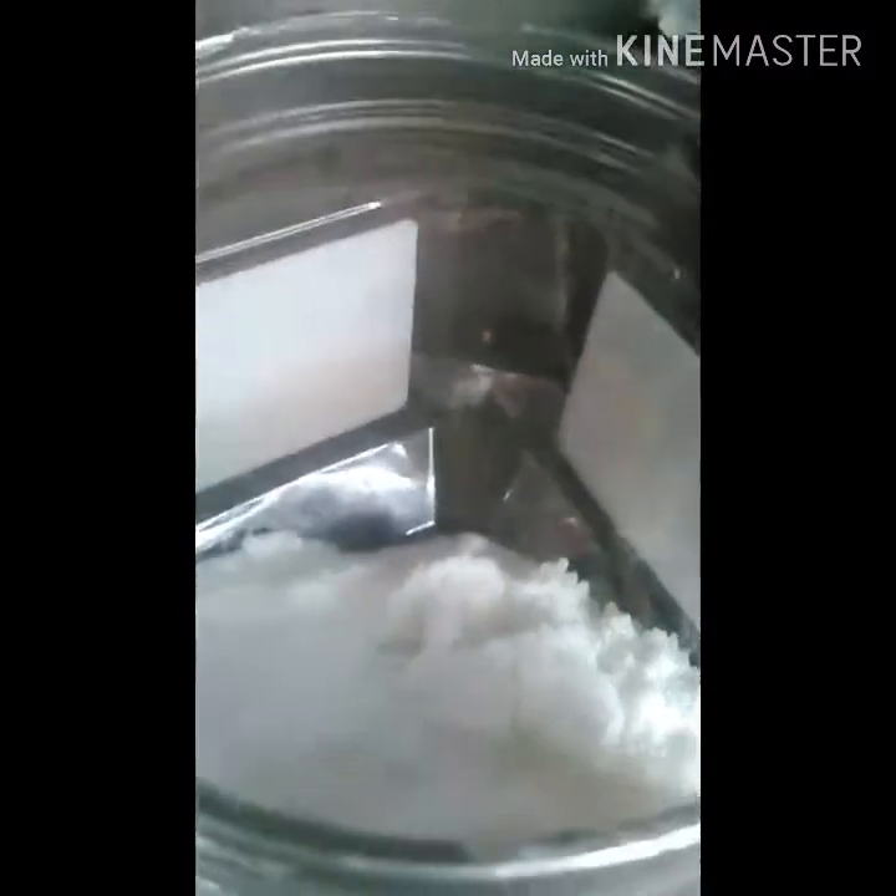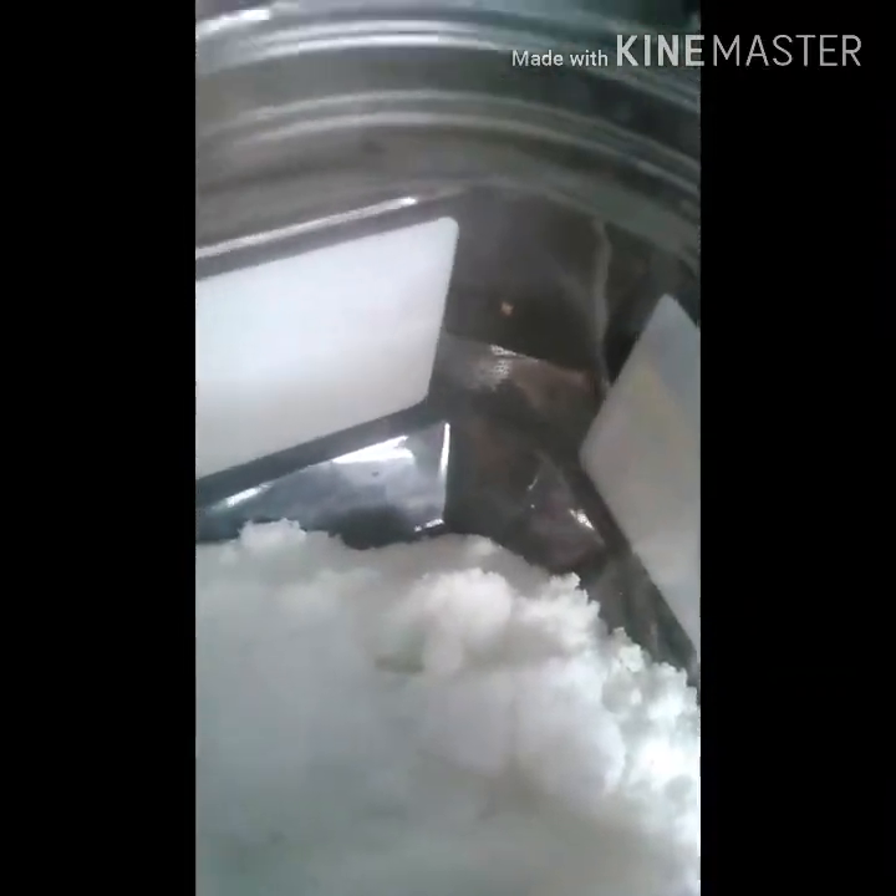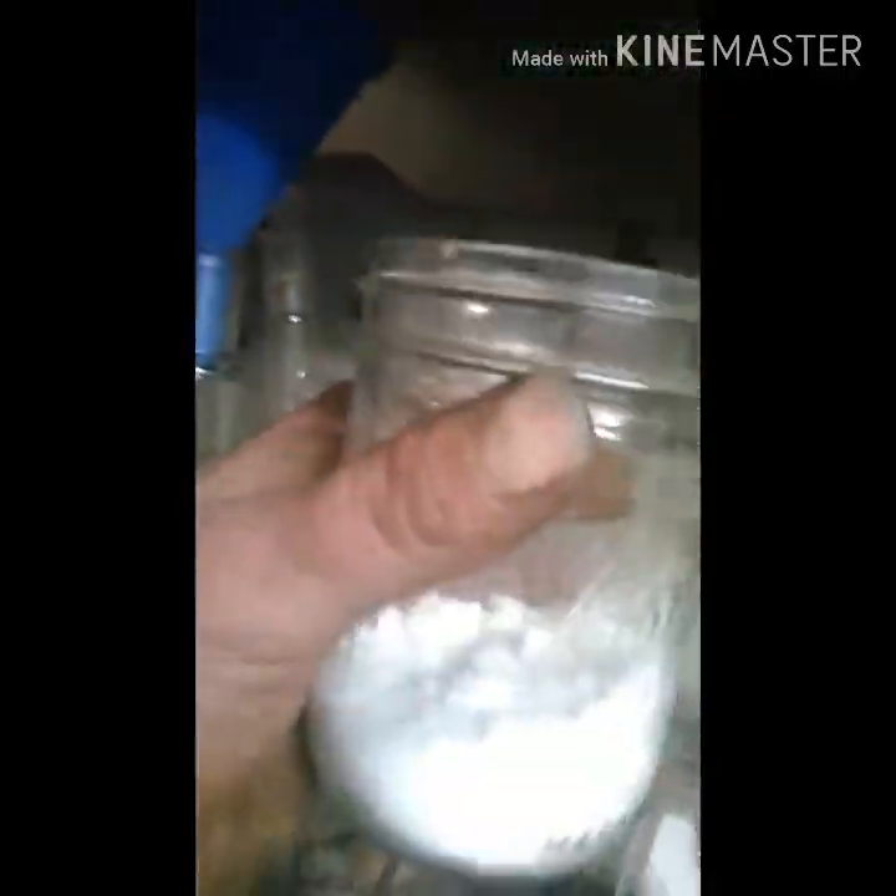Let's get started. Alright, so in here I have 280 grams of sodium bisulfate — that's with '-fate' at the end — and then in here I have 120 grams of potassium chloride. So now I'm going to combine these two, give them a good stir, and then put them in.